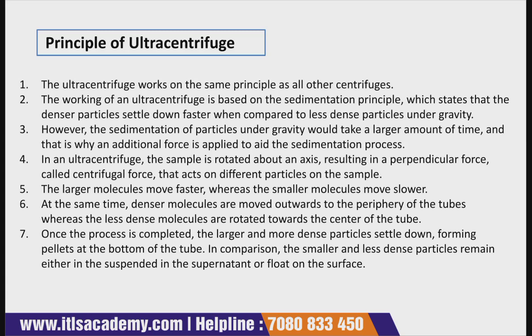So they are used to separate the components of a solution based on size and density. It generally separates on the basis of size and density, right? So let us understand this part, and then we are going to discuss each principle in detail.